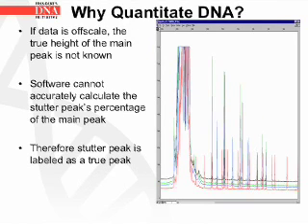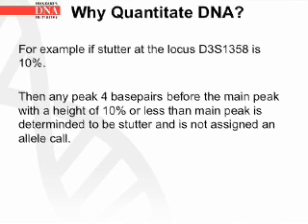If data is off-scale, the true height of the main peak is not known. Therefore, the software cannot accurately calculate the stutter peak's percentage of the main peak, and in situations like this, the stutter peak may be labeled as a true peak. For example, if the stutter at the locus D3S1358 is 10%, then any peak four base pairs before the main peak with a height of 10% or less than the main peak is determined to be stutter, and therefore is not assigned an allele call.